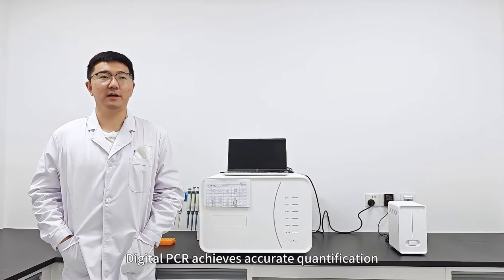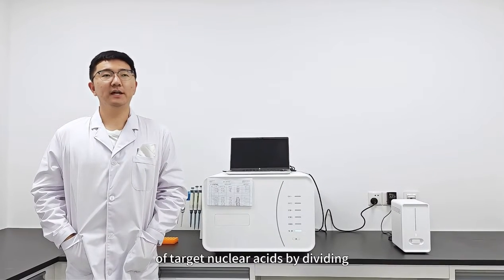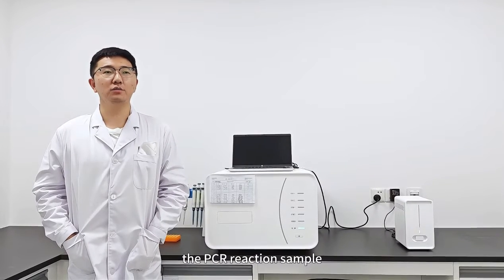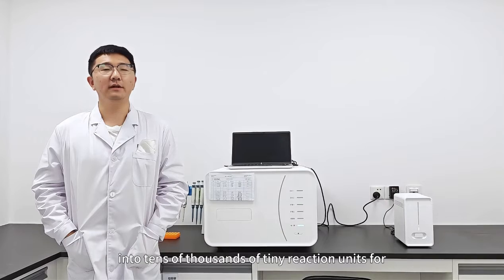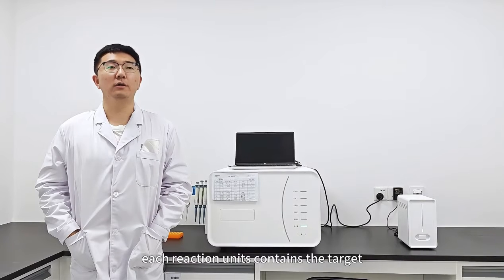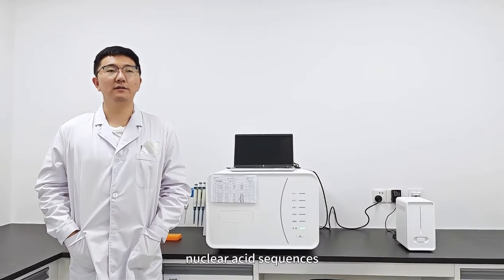Digital PCR achieves accurate quantification of target nucleic acids by dividing the PCR reaction samples into tens of thousands of tiny reaction units for amplification, and then determining whether each reaction unit contains the target nucleic acid sequences.